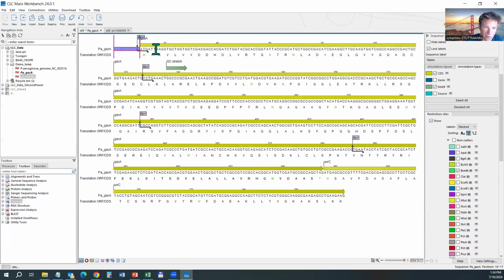So they would be part of a PCR primer. Making PCR primers, you can make it complicated with many rules. You can make it easy by just looking at the sequence. And in this case, I would surely take the second option, because anyways, it has to be at the beginning of the primer. The oligonucleotide has to bind at the beginning of the gene if I want to make this fusion when put into this plasmid like this.